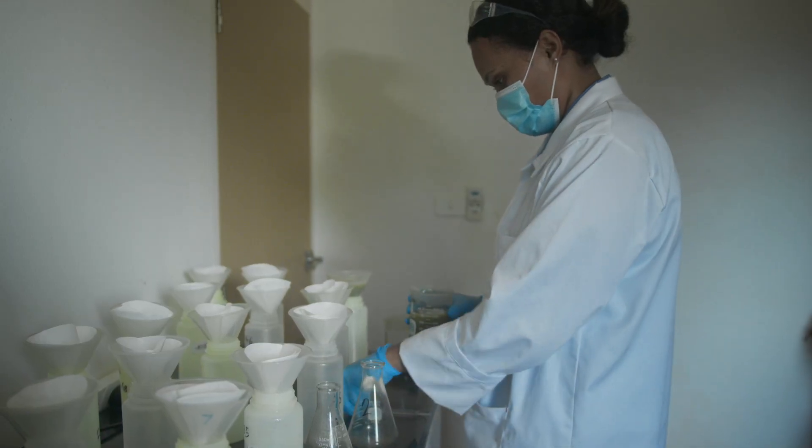Welcome back. Now we'll be taking a look at those two roles that were mentioned earlier. First up is the Sewer and Leaf Analytics Service. My name is Doreen Pillay and I'm the Senior Scientific Officer at the Sugar Research Institute of Fiji. This cane analysis is a very integral part of our research institute.